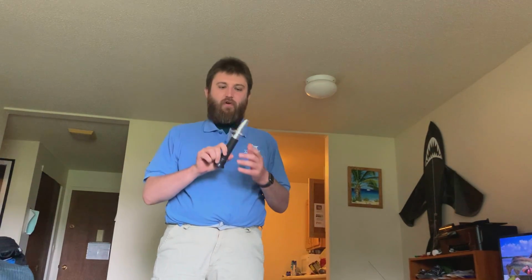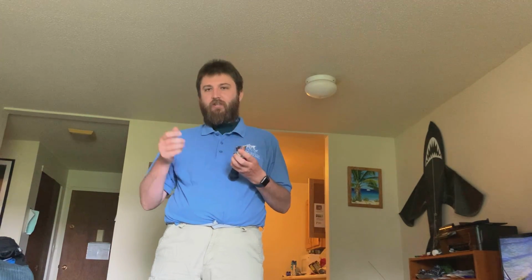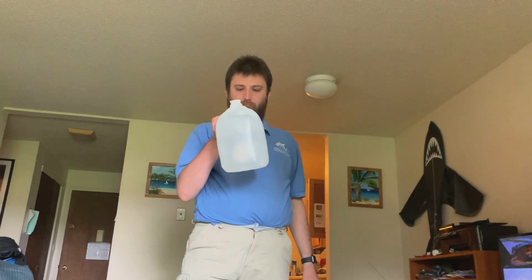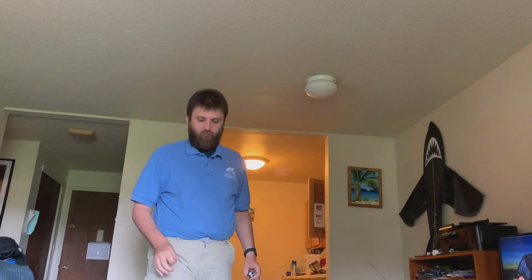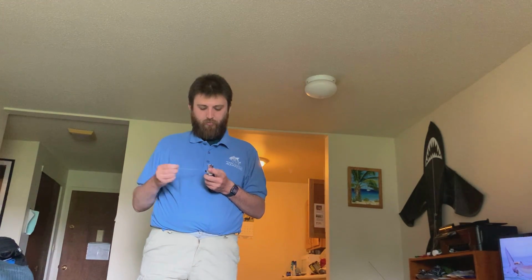With this, a refractometer. But since I just got this about 2 days ago, I have to calibrate this. So how do you do that? Straight up DI water. This is what's in here. So how do you do it? You take your eyedropper. Probably can't see what I'm doing right now, but take your eyedropper, you take some of it out, and you pour it on to the top.